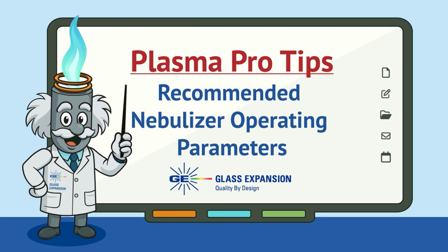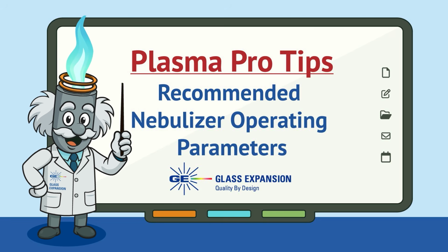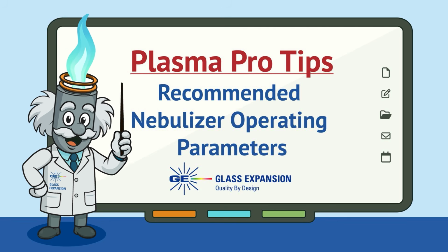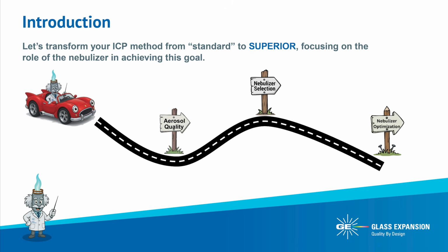In today's class, we will cover the effects of operating parameters on nebulization efficiency and overall analytical performance. Let's get started and transform your ICP from standard to superior by focusing on nebulizer selection, optimizing operating conditions, and a deep dive into how the quality of your aerosol affects the analytical performance of your ICP.